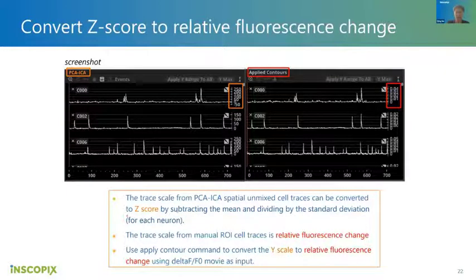It can also be applied to CNMF-E, right? Since the mathematics is the same thing. Take whatever Y and then just calculate that. Okay.